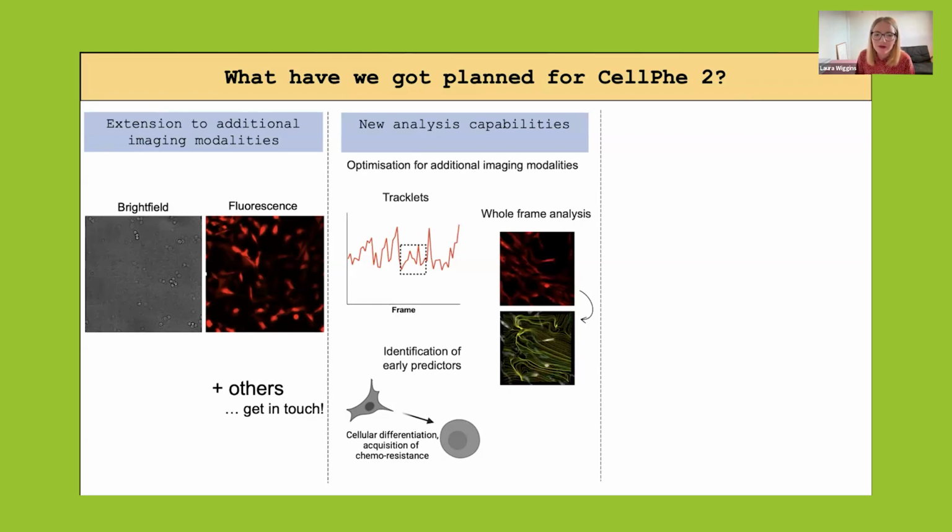We also want to incorporate tracklets, which will be able to fragment whole cell time series and hopefully shed light on timescales within your data set where interesting behavior is happening, but you're currently missing it when comparing just whole cell time series.